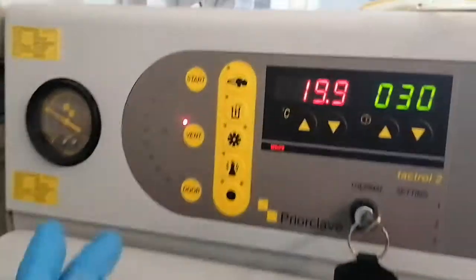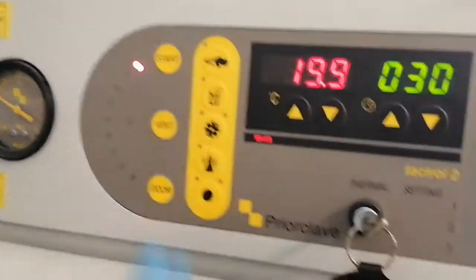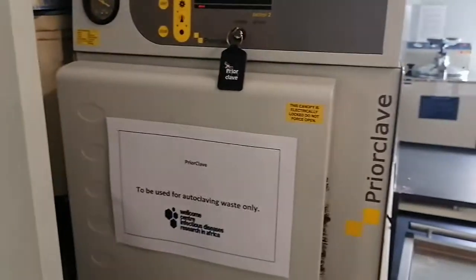Now you wait for the click again, and then the start button will light up. You press start, and it's going to run for 30 minutes. We'll come back in an hour, because this is a really slow autoclave.